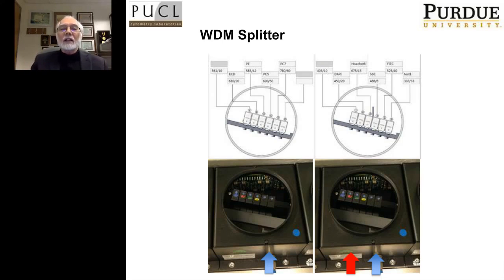And so there are now 3 APDs on either side of that mirror, and 1 fiber optic is serving one side and a different fiber optic is serving the other side. And as I said, I'll come back to that later, because this is one of the fundamental amazing advantages that I see in this instrument, because it gives you an almost unlimited number of combinations that you can manipulate with just a very, very simple process.